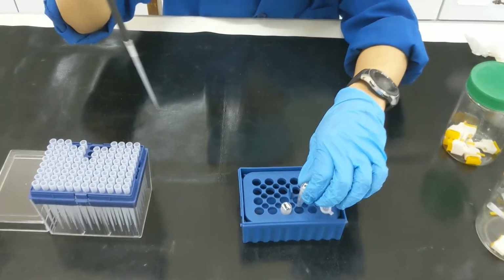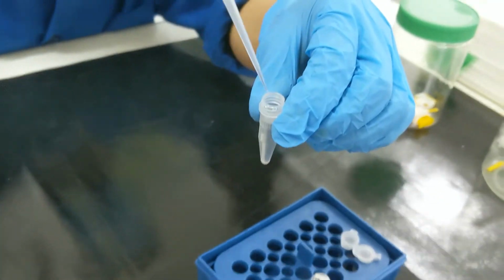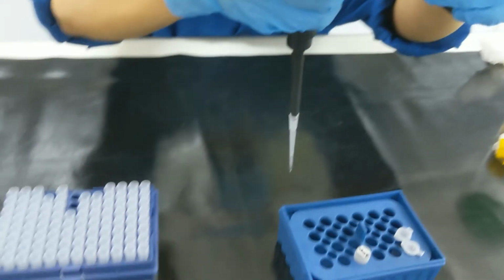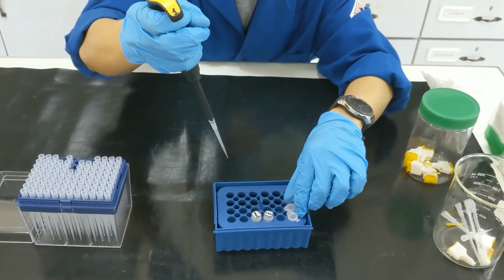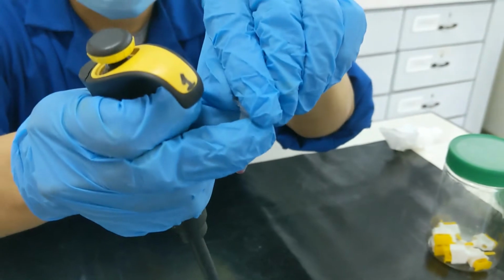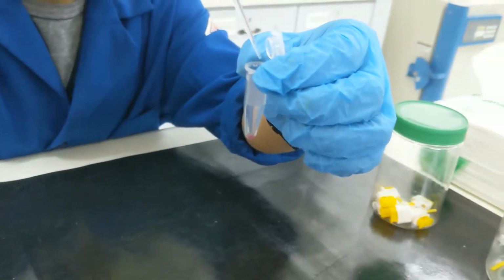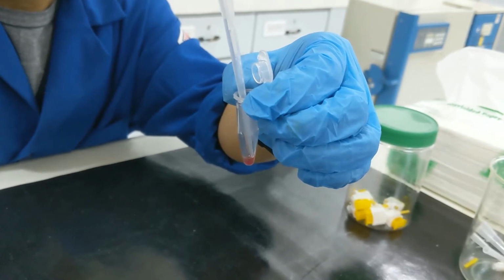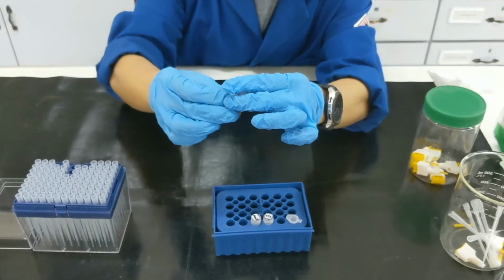And now for our cell lysate sample, we need potassium chloride. And then we are going to dispense this with the pellet that was left a while ago when we removed all of the serum. Okay, this potassium chloride has a specific molarity, which when mixed with the cells, will cause the cells to lyse.